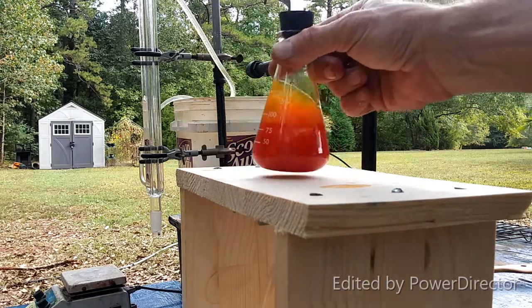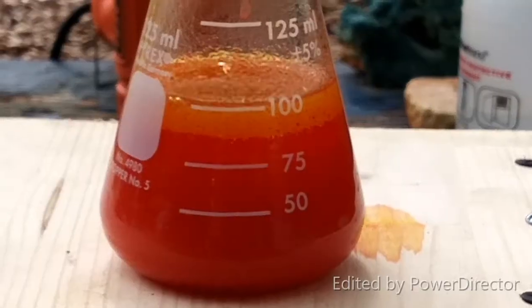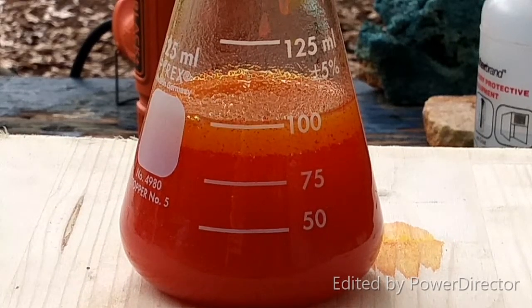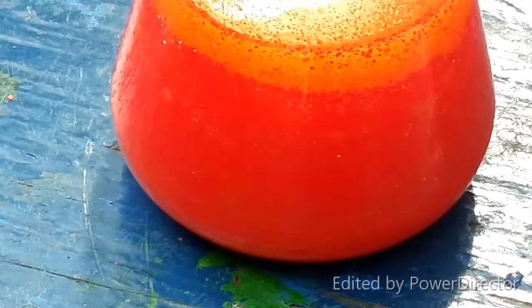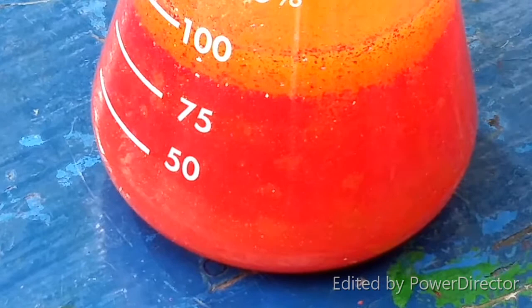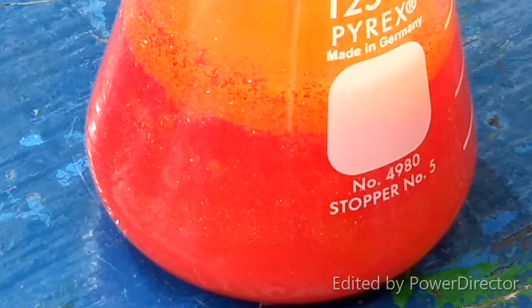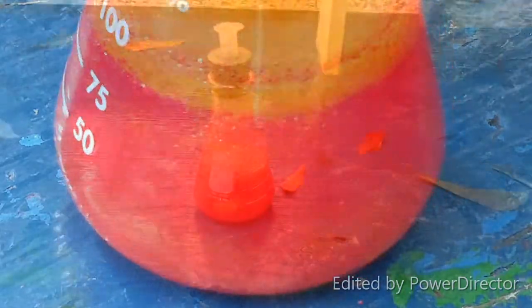All right, you see we're already getting some very nice crystals there. Look at that. Let's see, I think you can actually see it better from the other side. Yeah, there we go. There we have it, y'all. Crystals of antimony triiodide. Look at that color.